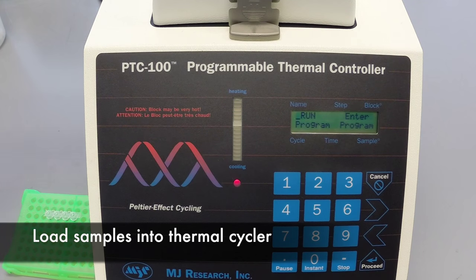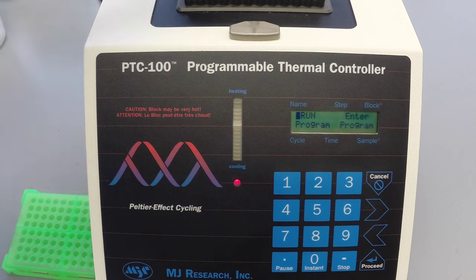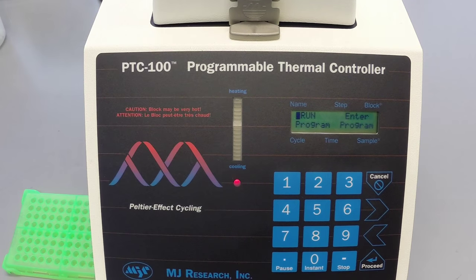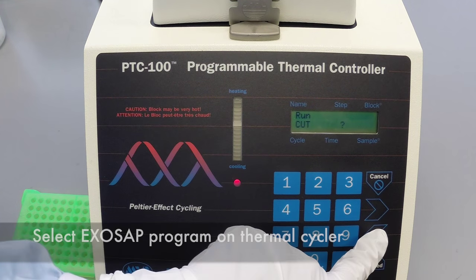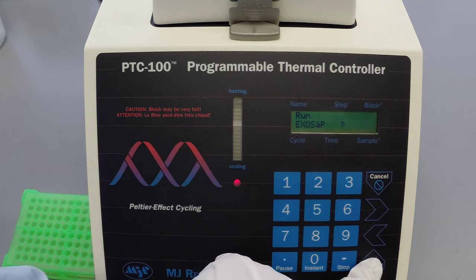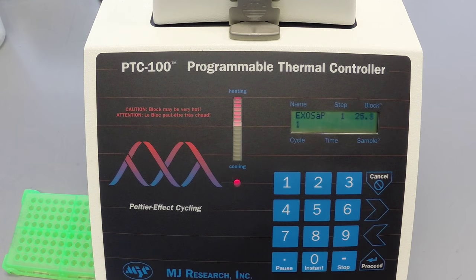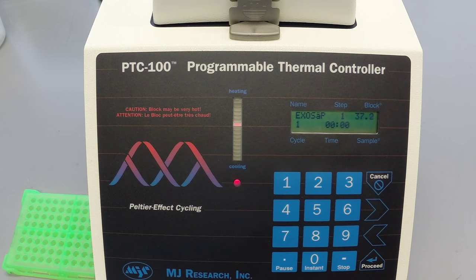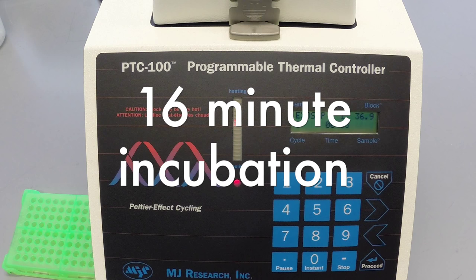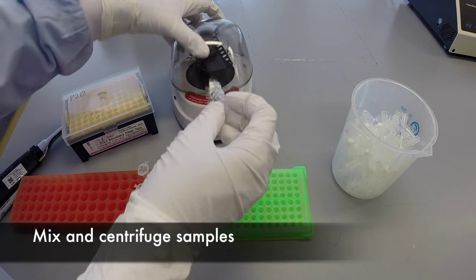Place the tubes in the thermocycler and navigate to the ExoSAP program. Once the digestion of free nucleotides has completed, mix and collect the samples.